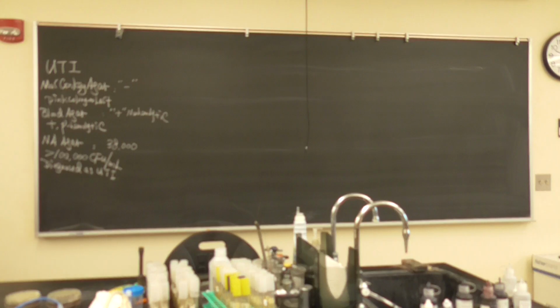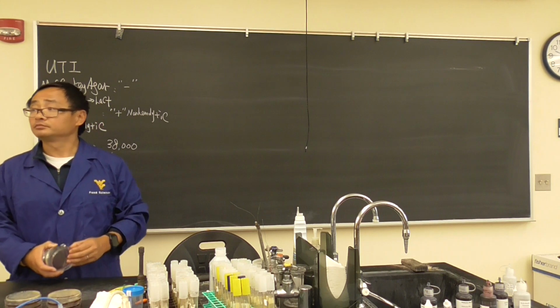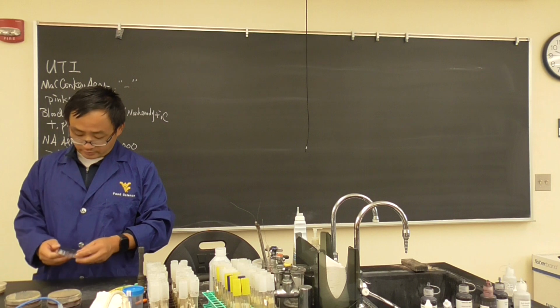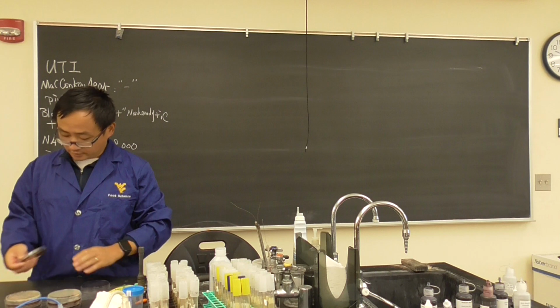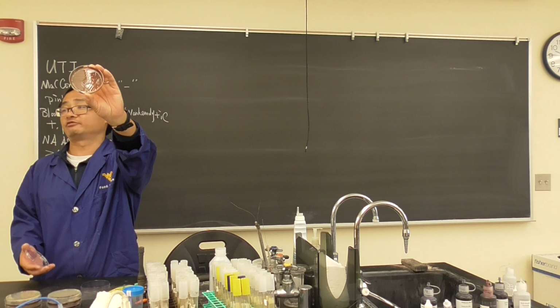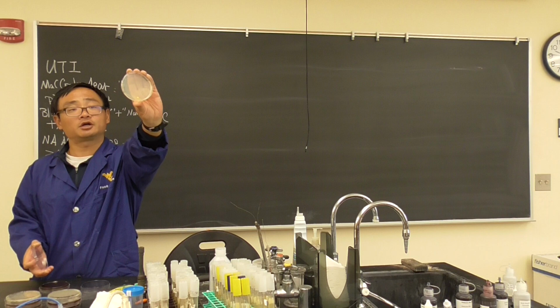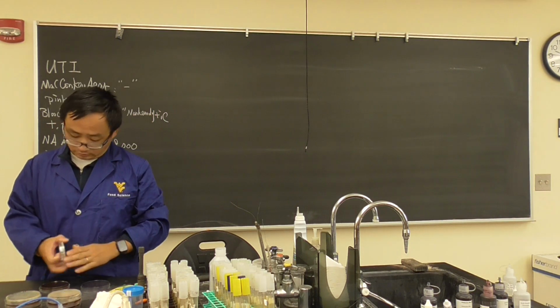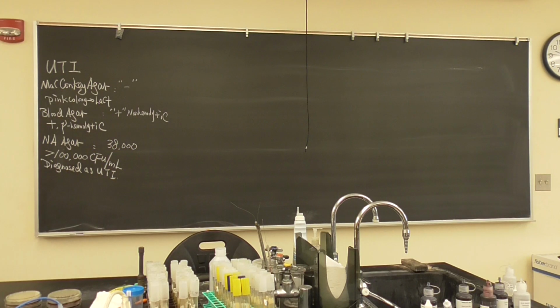Yes, let's look at the last plate. So this is from a male patient. Presumptive. Nothing grows on the MacConkey agar. Very good. Basically nothing on blood agar. That is a cross-contamination, obviously. And you have only one cross-contamination, a red colony and a yellow colony on the nutrient agar. So I would say this guy is good. Pretty healthy. Keep doing the good work.